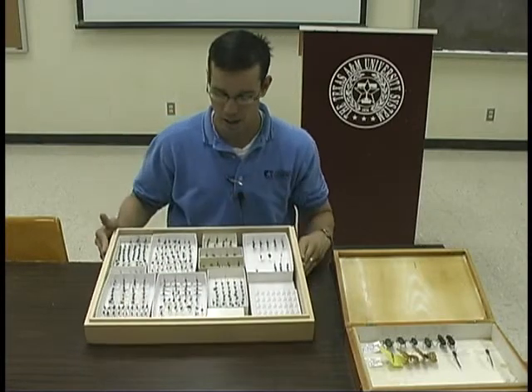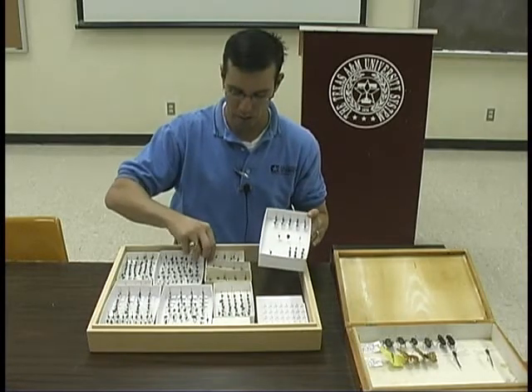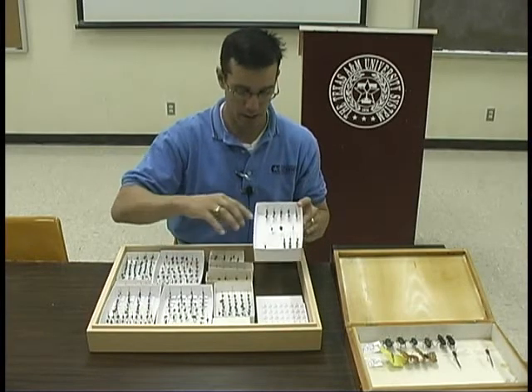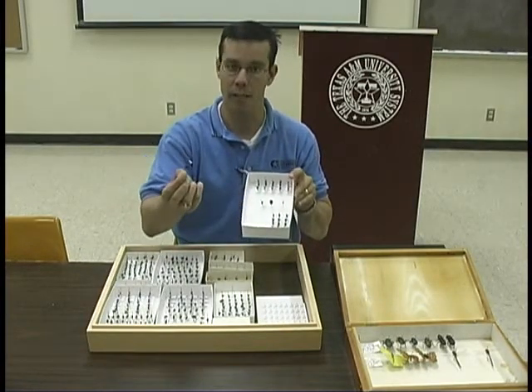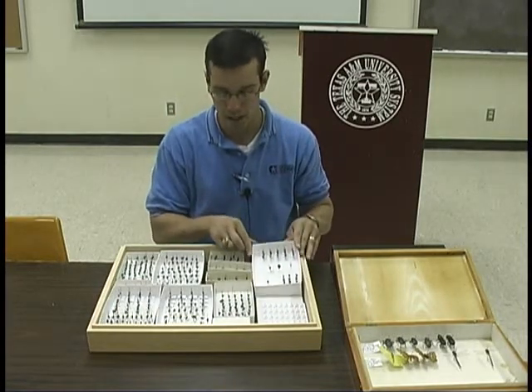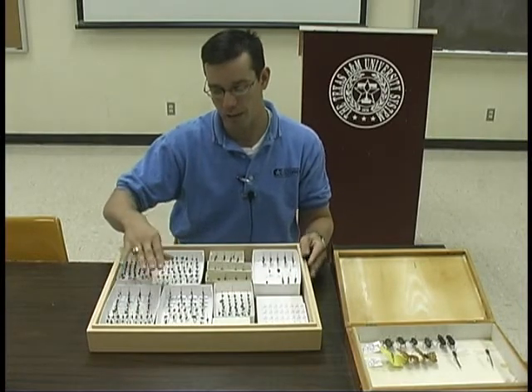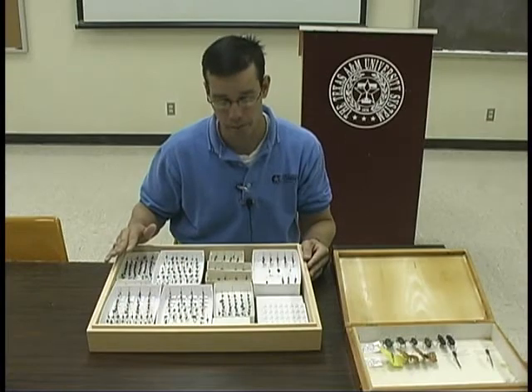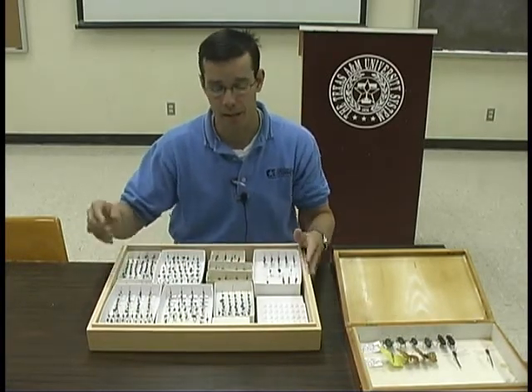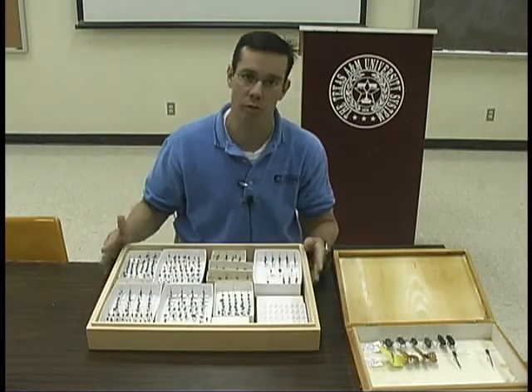These collection boxes come in a variety of different shapes, from these large boxes all the way down to smaller units. They are lined in styrofoam, which allows you to stick the insect pin into the styrofoam so it's placed and will not fall out. This particular Cornell drawer is not lined in styrofoam — that's what allows us to put these unit trays in here. You can also get Cornell drawers that have styrofoam across the bottom, where you can place insects across the whole surface of the box.